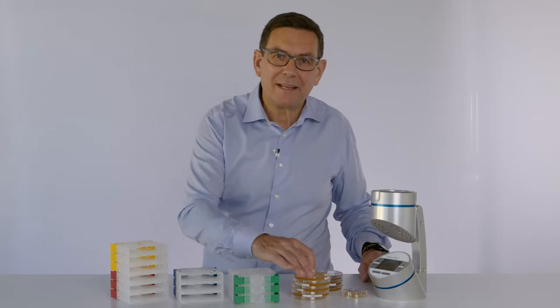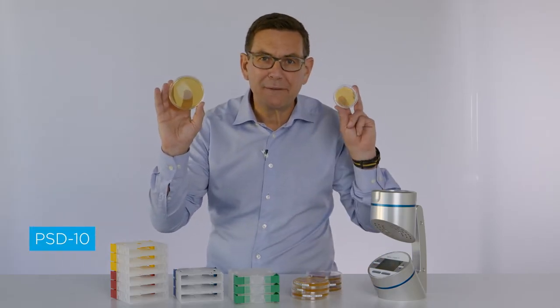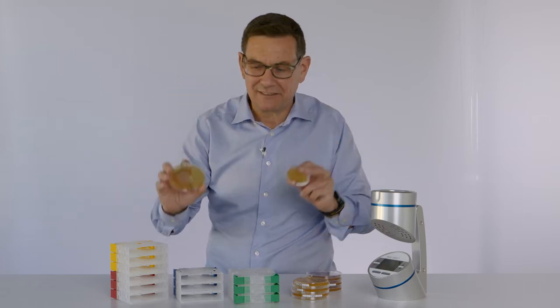These are Petri dish dispensers or in short PSDs from MBV. You can place one 90 mm saddle plate or 55 mm contact plate in each of the dispensers.